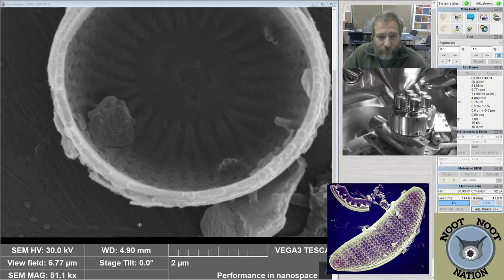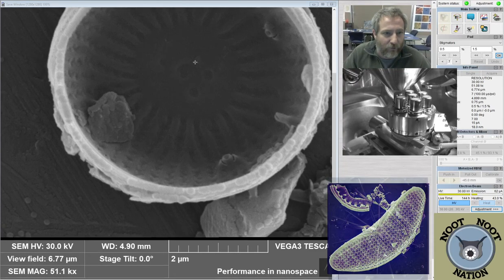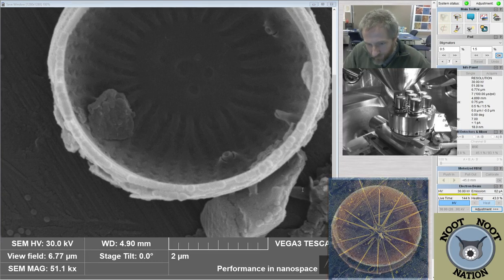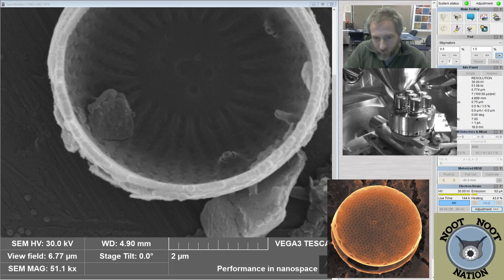I don't know the species off the top of my head, but there's a bunch of little tiny Discostella that are hard to tell what they are. While we're on the topic of Discostella, this is the internal view of a Discostella. I'm just going to call it tiny for now.